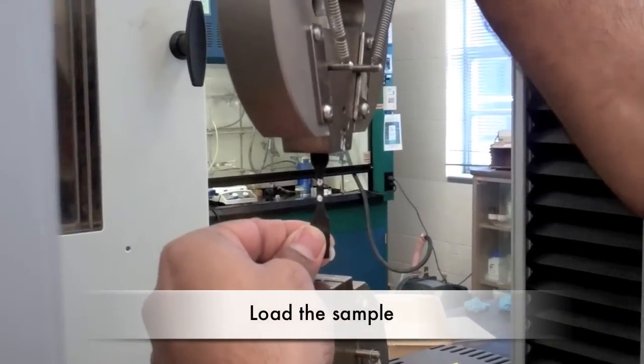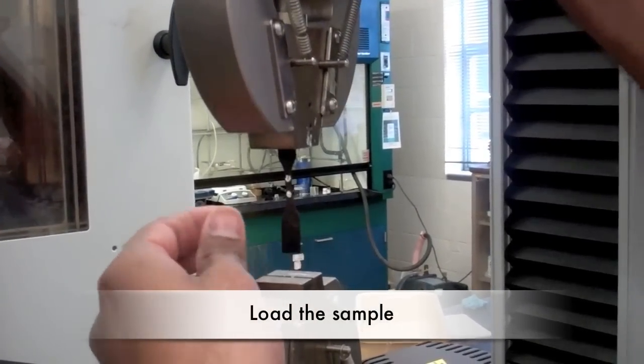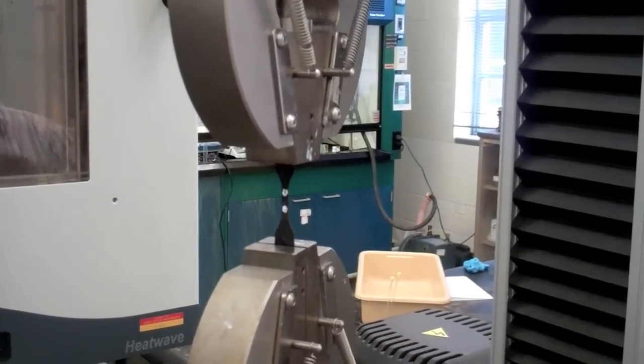Load the sample into the holders, tightening the top clamp first and then the bottom. Eliminate any slack in the sample by using the black roller on the controller.